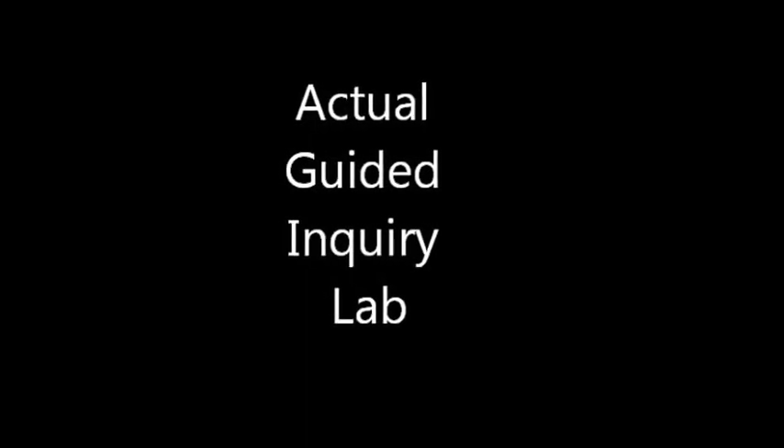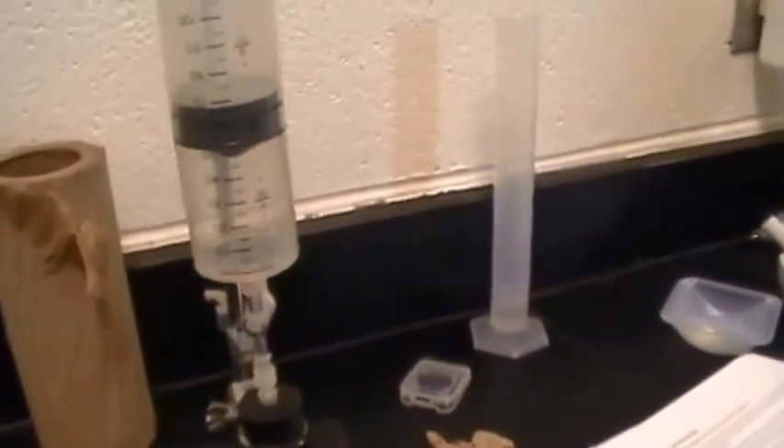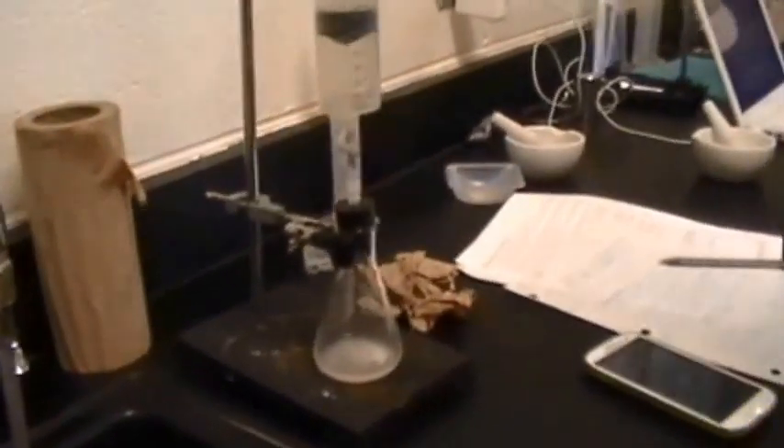We'll do it again at four minutes. Here we are starting our actual experiment with 0.51 grams of calcium carbonate and 10 milliliters of 1 molar HCl. We're going to judge it every one minute. Now on the seventh minute, we are decompressing and releasing to overcome friction, and it reads 52 milliliters of carbon dioxide after seven minutes of reaction.